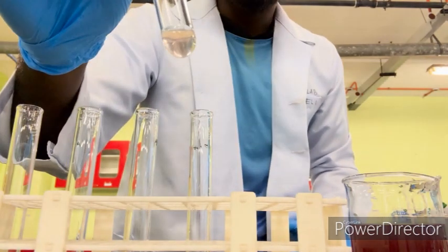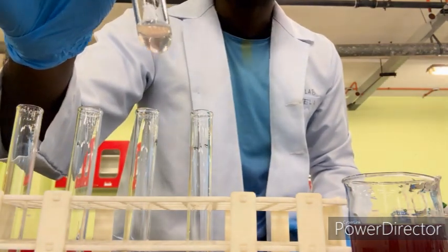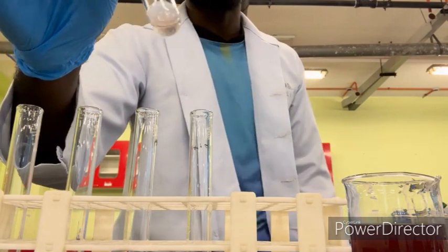These are the reaction once we add our onion peel extraction into our distilled water.